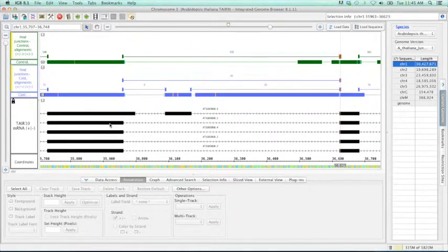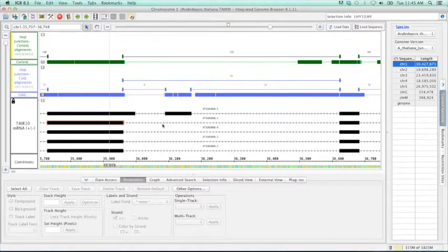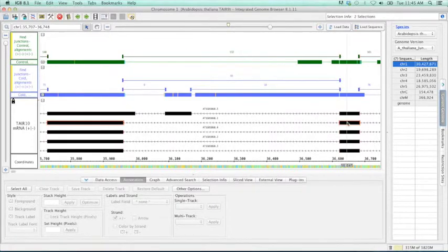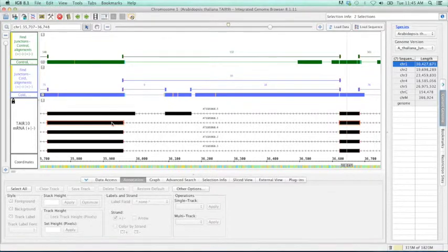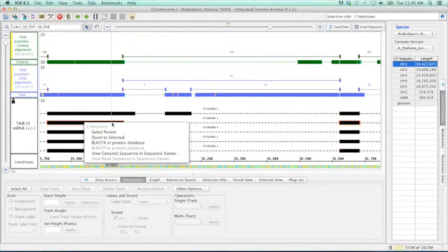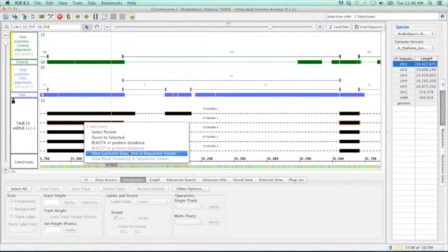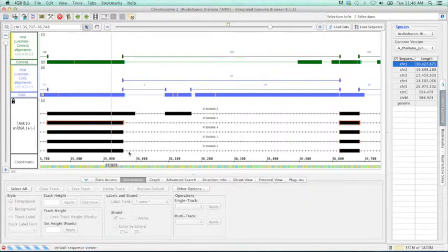In order to do this, let's start off by clicking on our gene model here. And then I'm going to shift click and click on the opposing flanking exon. So we're surrounding our exon here. Then I'm going to right click and view genomic sequence.